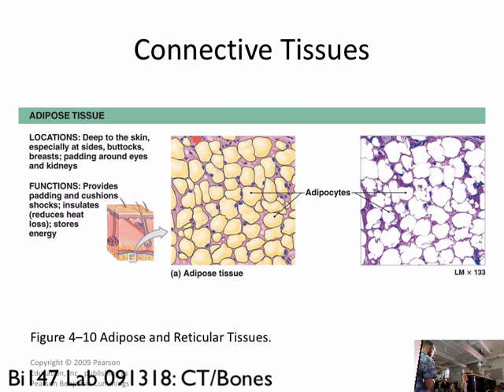Looking at it, everybody got an adipocyte up there? So the big empty spot is the fat vacuoles. Yes, ma'am? It's really hard to see. So start on the low res, and then let's open up your apertures. So see some length there. Yeah. And then let's find our sample. Where is it? So that's low. Let's start high. Start high, go low. Oh yeah, there we go. And then, so there it is.